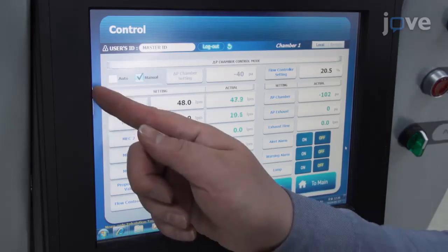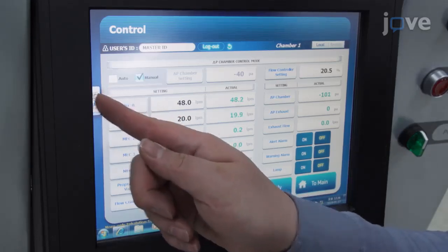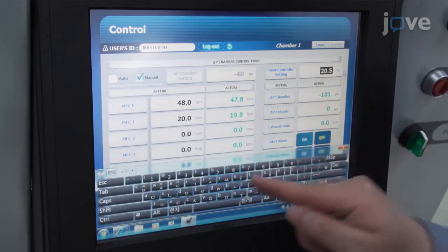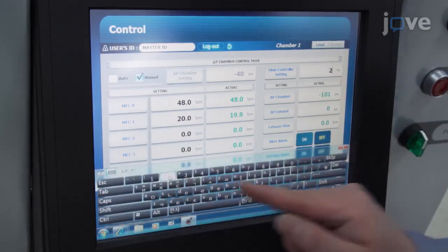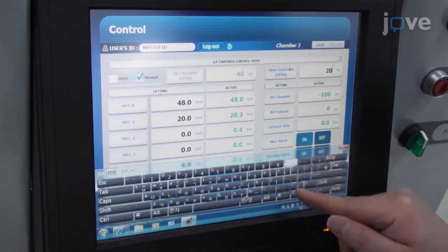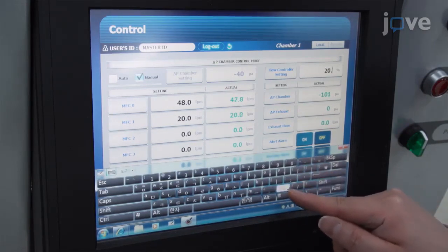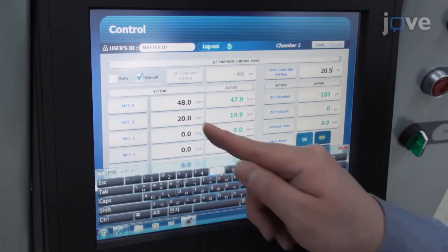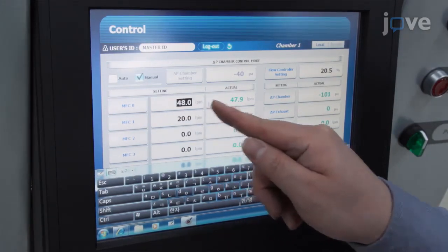Start flowing clean air through the aerosol inlet and the sheath at 48 and 20 liters per minute, respectively. Set the exhaust pressure differential to negative 100 pascals.